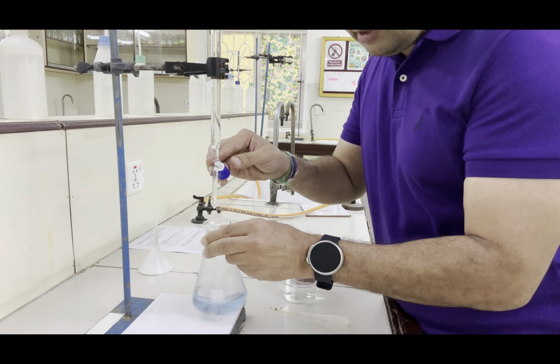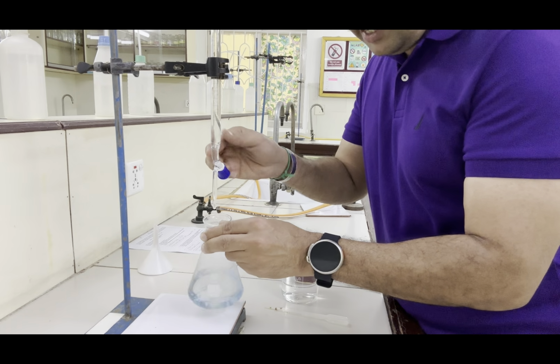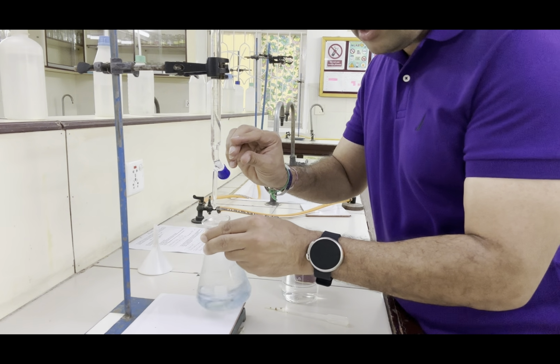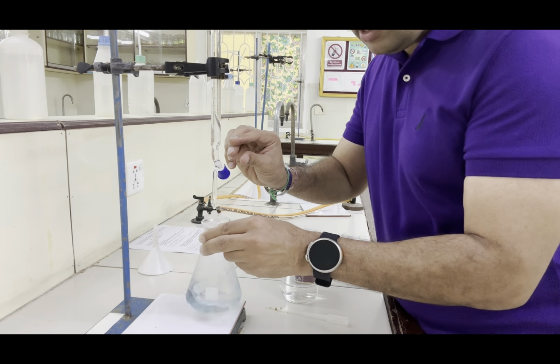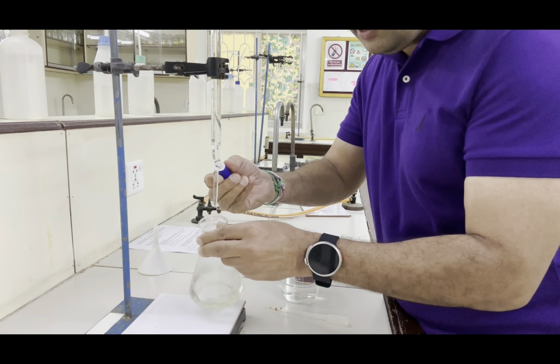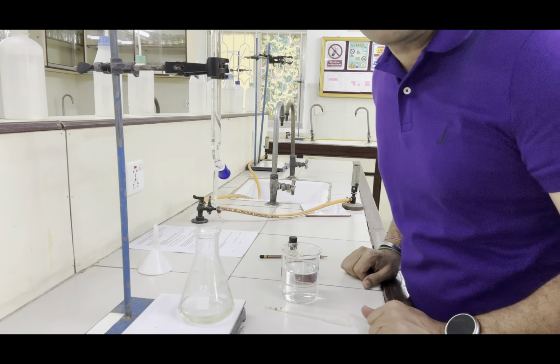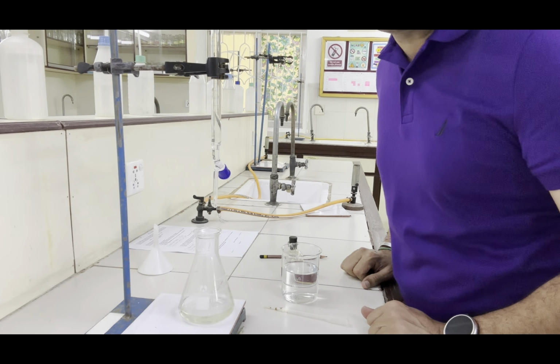Do not panic if it is taking a bit more time. Do not rush and open this knob faster. Just wait and be calm. It will turn yellow, and it is now yellow. You can see the contents are yellow and I have stopped. So this is my accurate titration result.